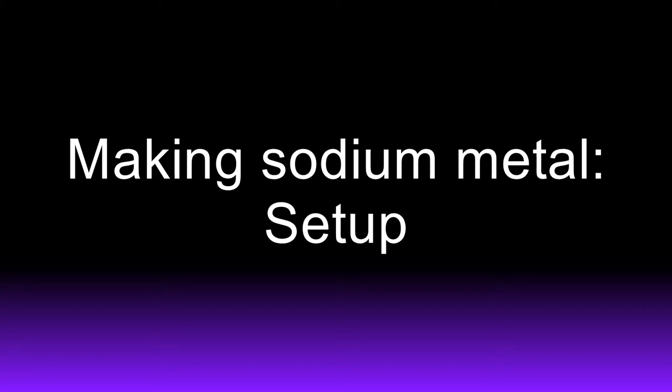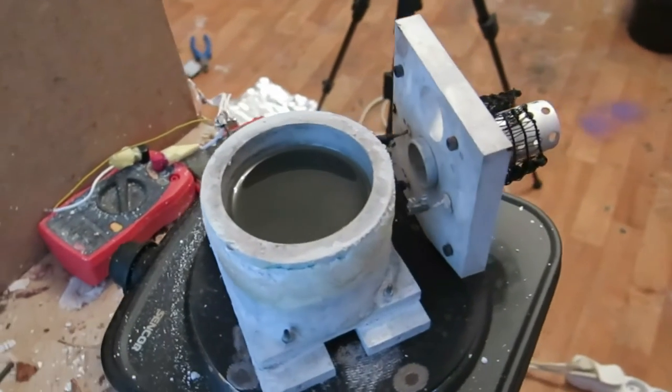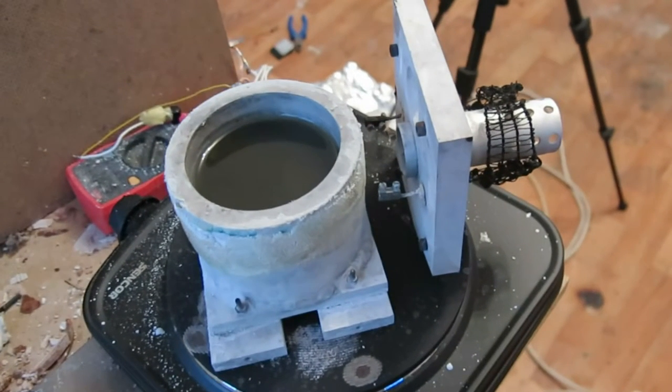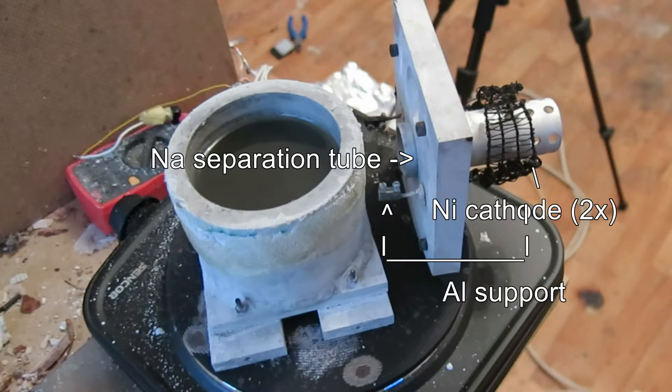This is my setup for making sodium metal. Here is the cell placed on a hot plate. The first part is an aluminum weldment which contains molten sodium hydroxide. The second part is used as a lid.